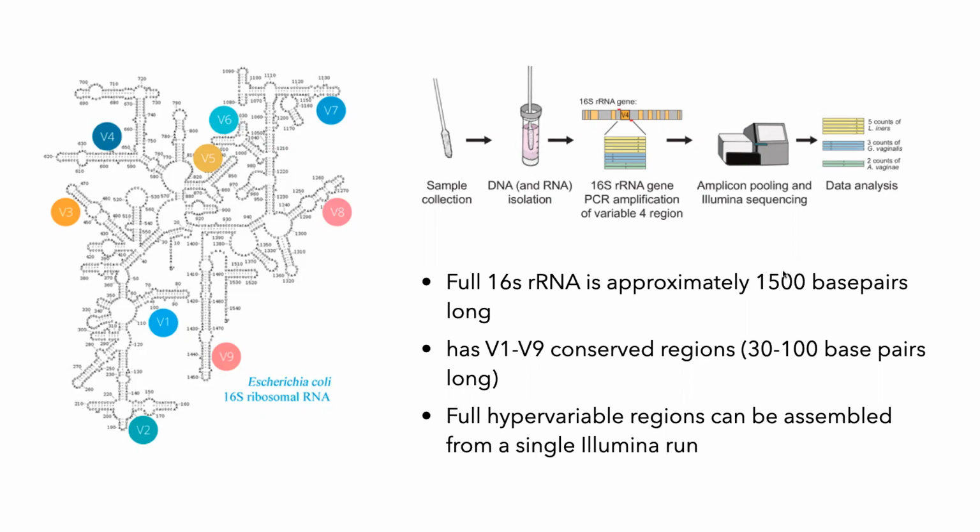It's more like 30 to 300 actually. And as you can see right here, we have 50 to 300. So each region is up to 100, so you can actually sequence the full hypervariable region.